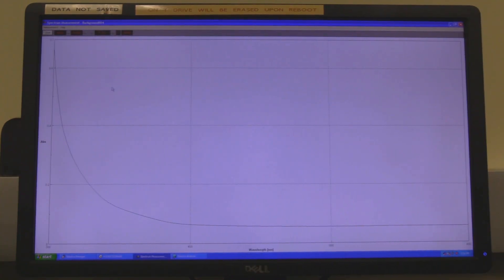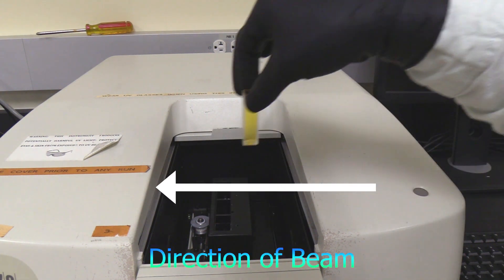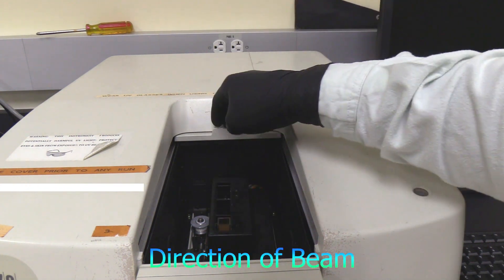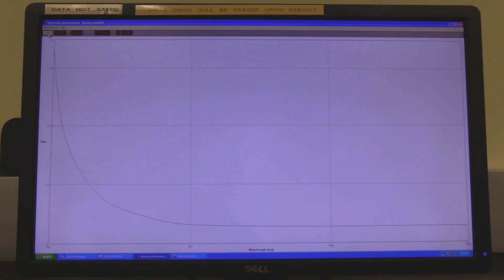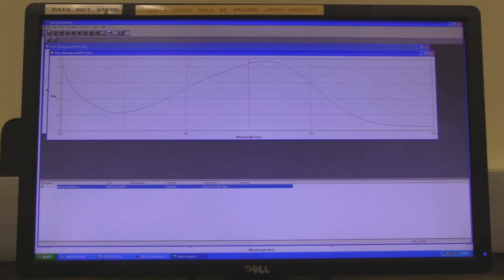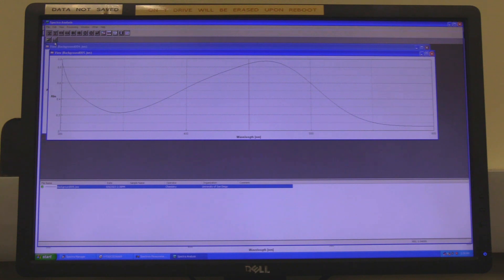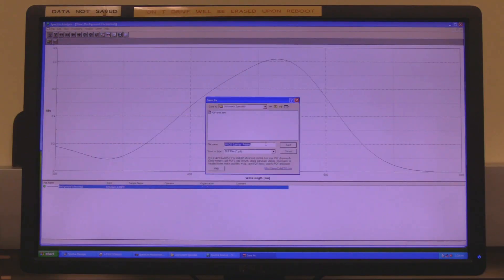Return to the spectra measurement window. Slide open the sample chamber lid, replace the blank cuvette with the sample cuvette and close the lid. Click on the start button. When the measurement is complete, spectra analysis will automatically open. If the autosave box was not checked, in spectra analysis click on file and then on save. Find the appropriate folder, name the file and click on save.